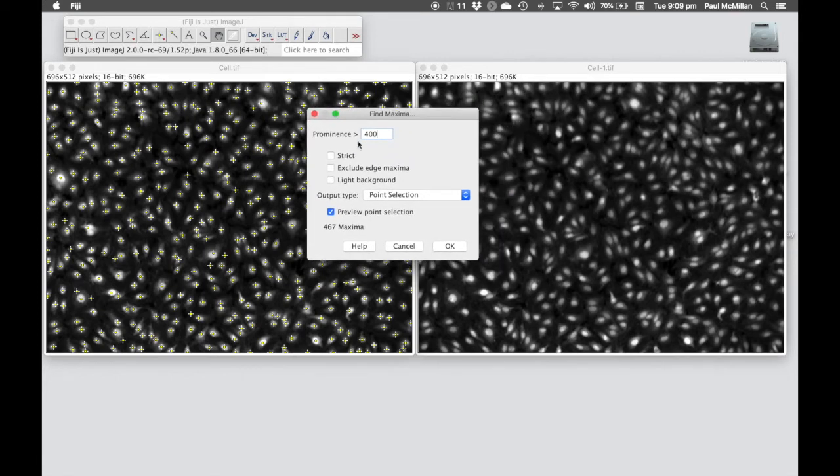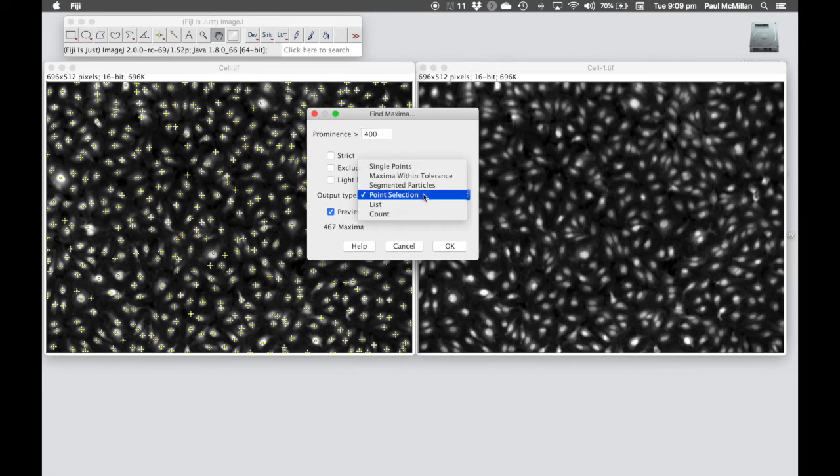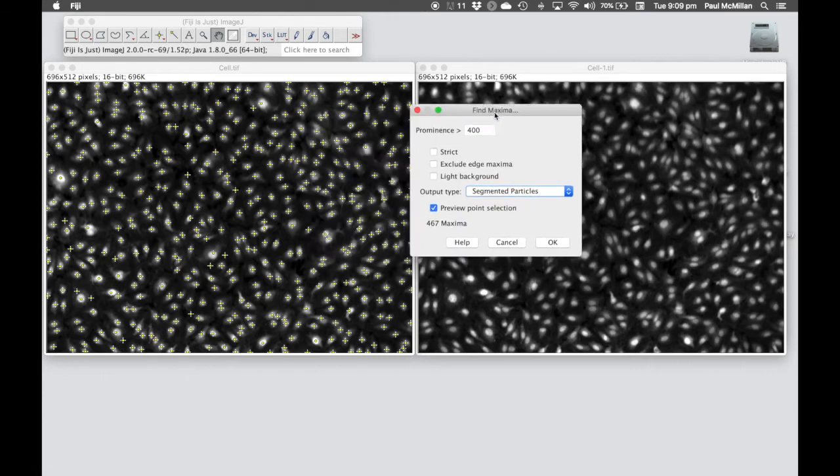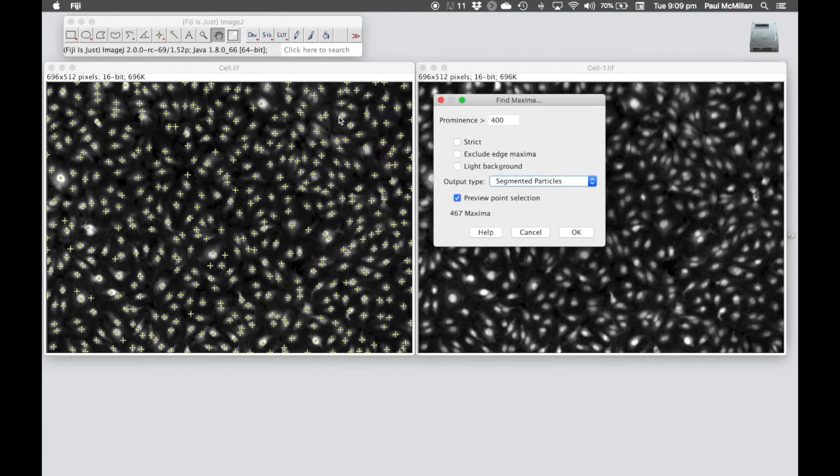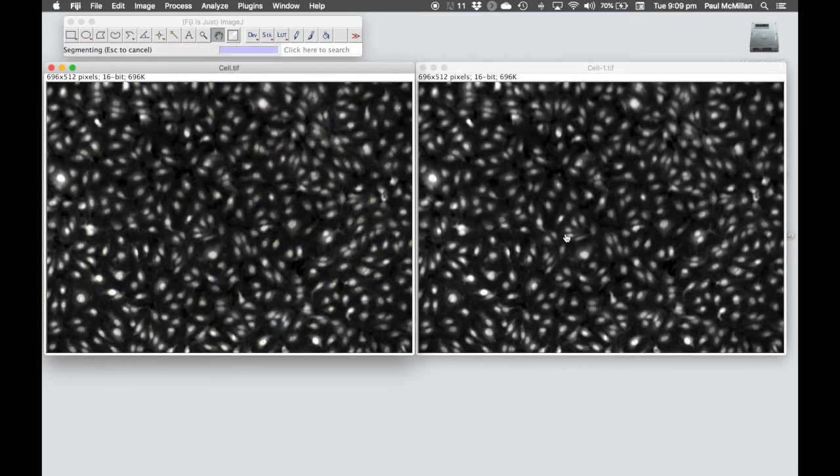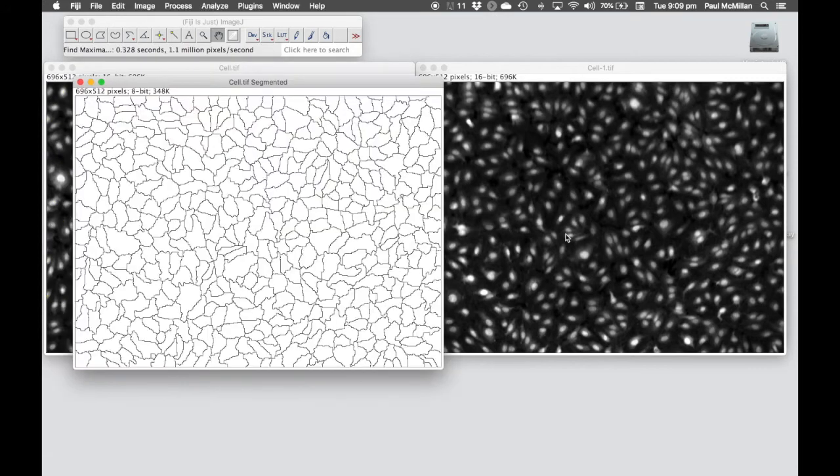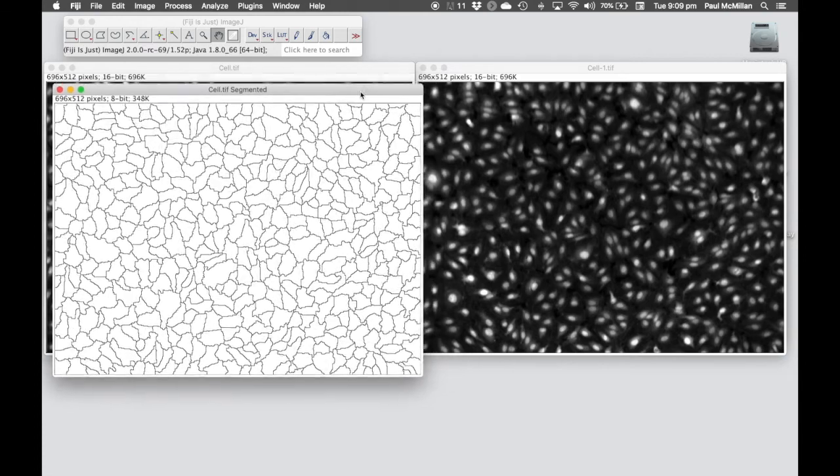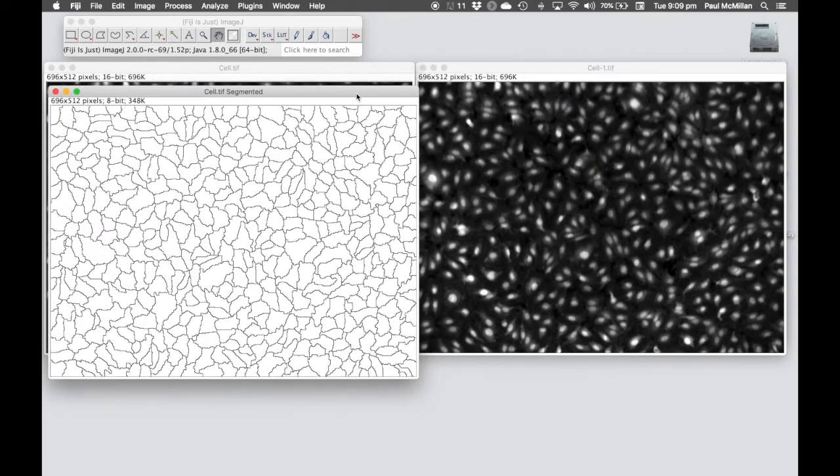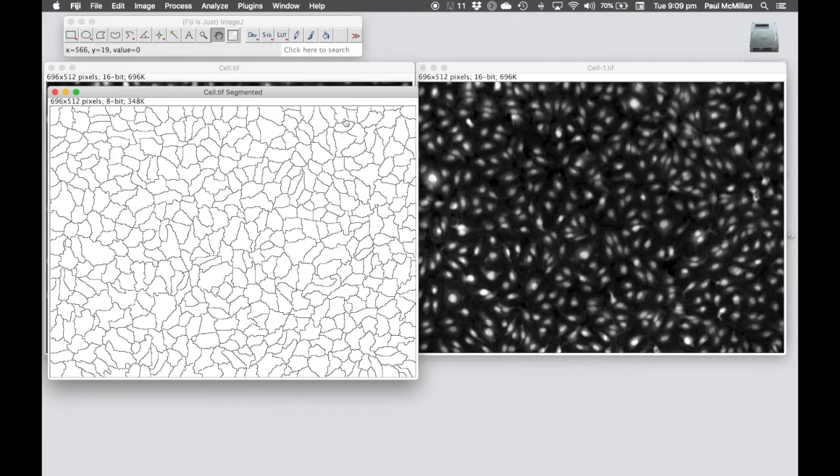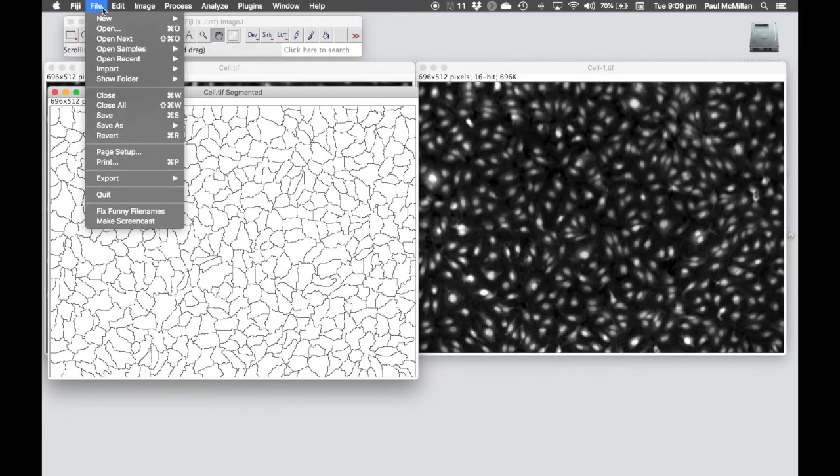In this case, we don't want to output the point selection. What we're going to do is something called segmented particles. It's going to try and draw a line in the gap in between each of these cells. We click OK and it provides us with something like this. We are going to save that as mask1.tif.